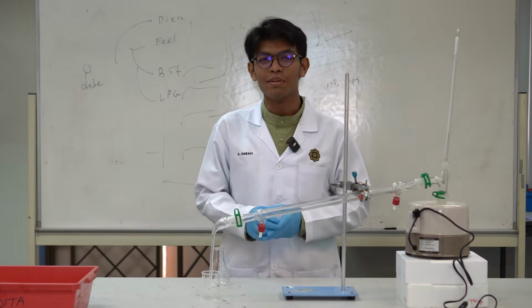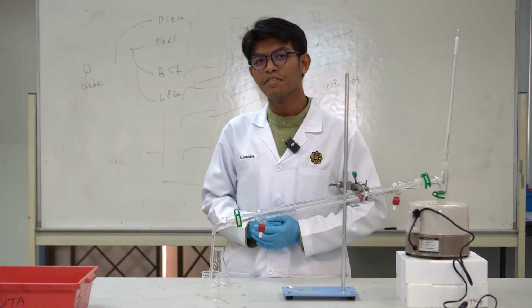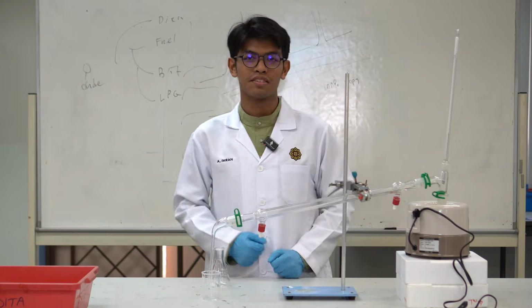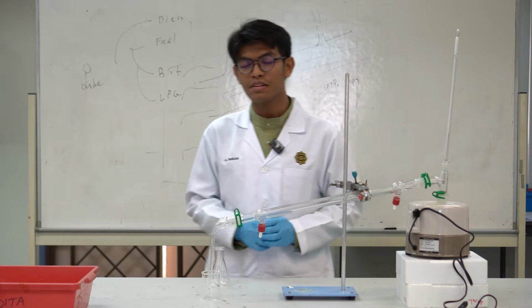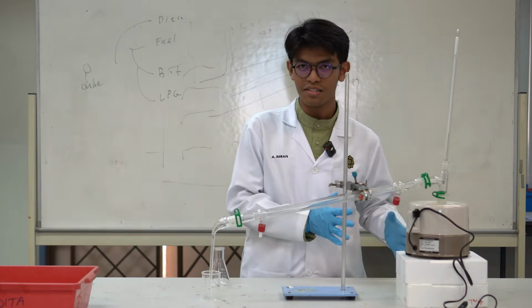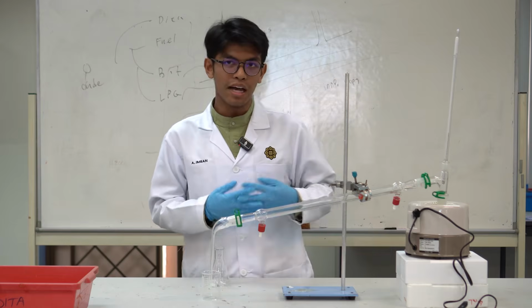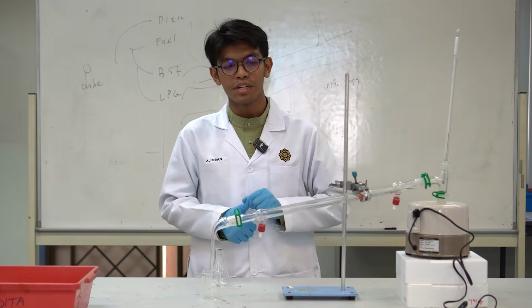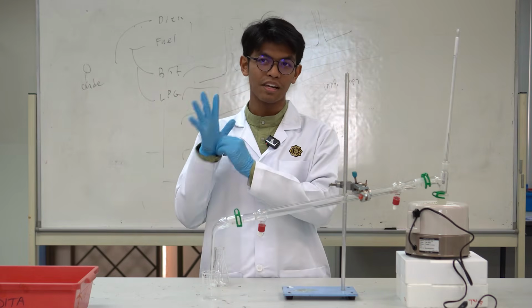Okay, for the next part, I will further extend the explanation about the precautionary and safety tips for the distillation process before, during and after the process. As a disclaimer, safety tips are very important, especially to ensure that there are no emergencies or accidents before, during and after the distillation. So the first tip is to always ensure that you wear your lab coat and also your gloves.